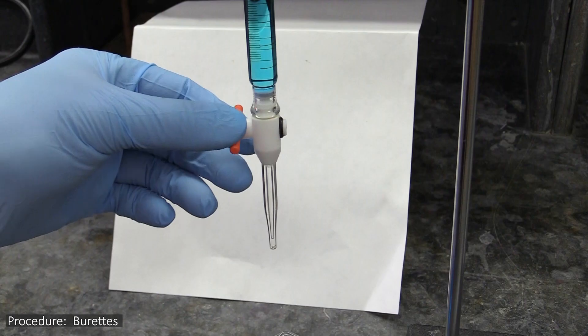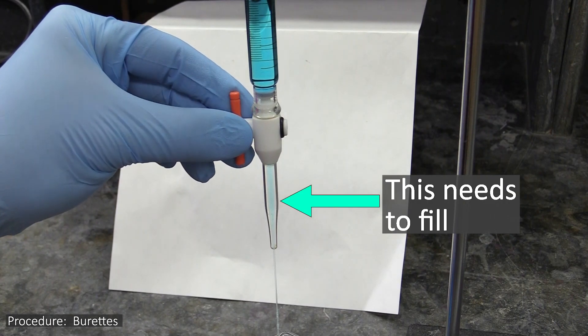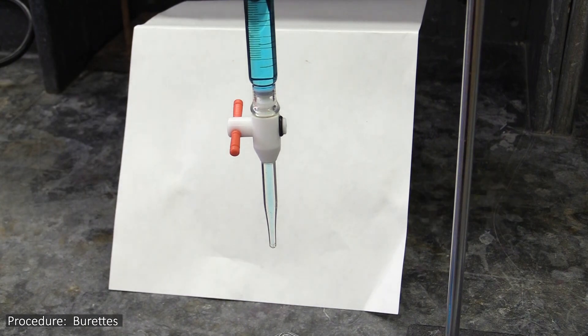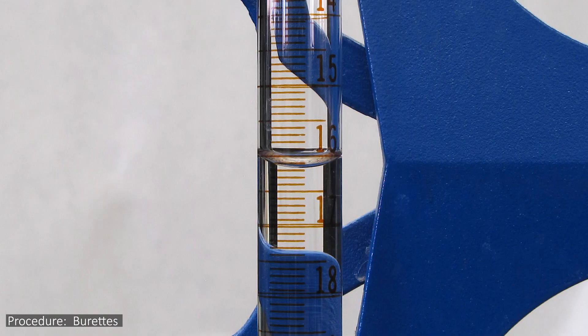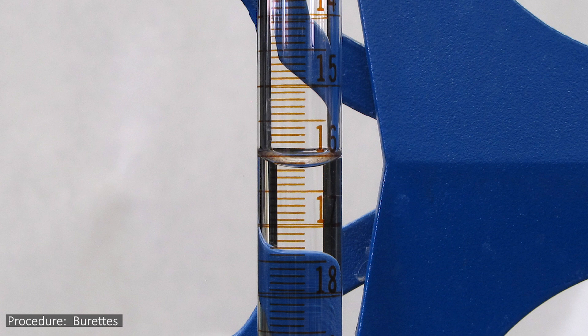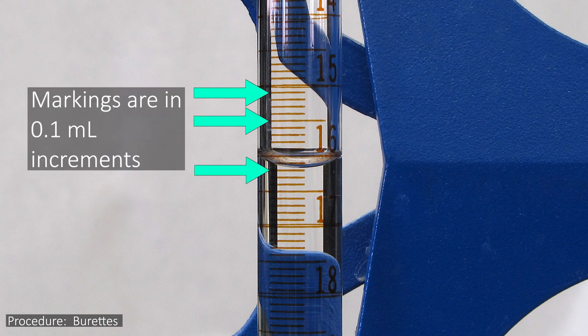There are two reasons for doing this. One is it gets all the air out of the spout at the bottom. The other reason has to do with how the burettes are read. Since the actual physical markings on a burette are in tenths of a ml, you have to interpolate between them to read in hundredths of a ml.